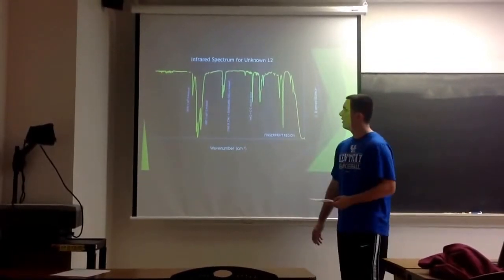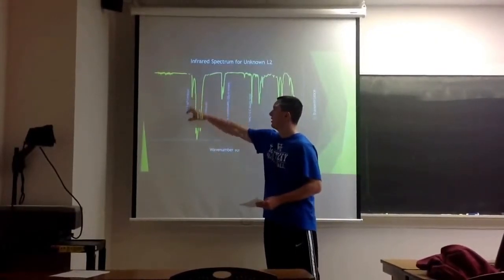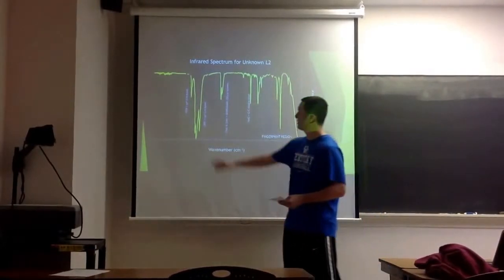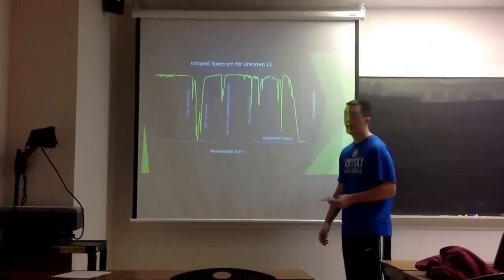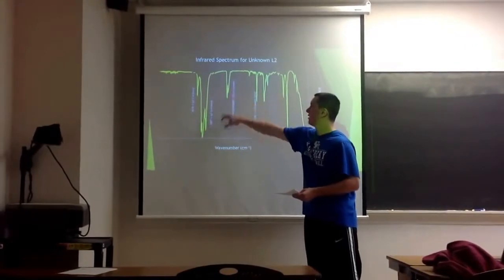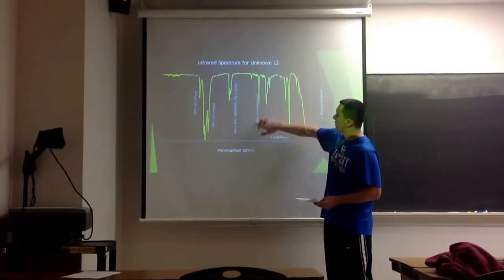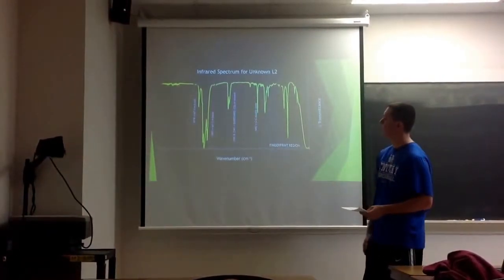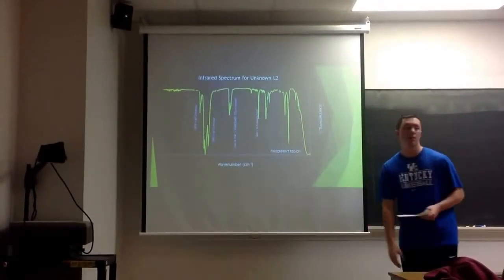For this spectrum here, we see an sp2 CH bond right here at approximately 3078. This one right here, more than likely, will be an sp3 CH bond. We can disregard this peak right here, it's actually CO2. This one over here, since it's around 1650, I would say is more than likely a CC double bond. Then of course we have our fingerprint region.